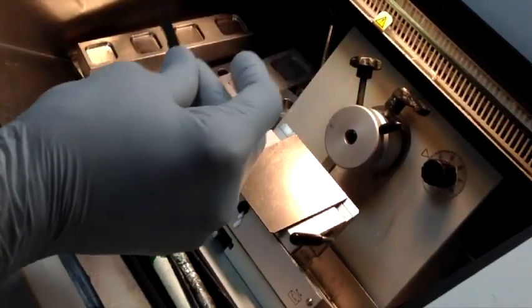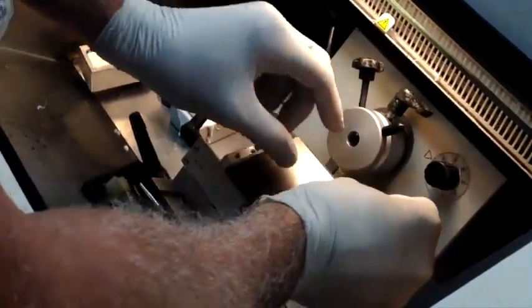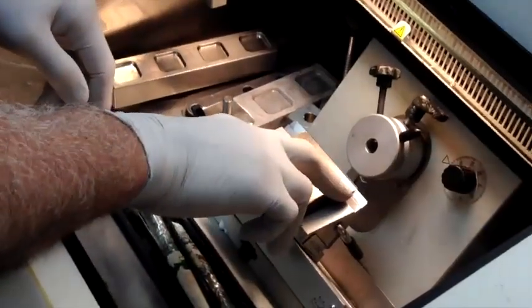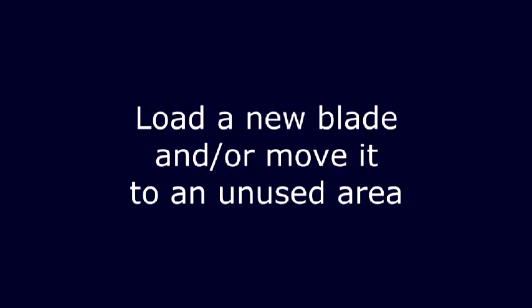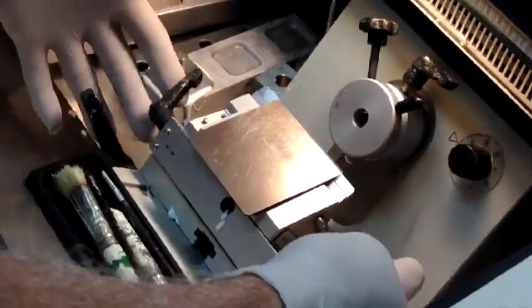I'm going to put a blade in. In the meantime this is continuing to freeze. I'm going to tighten this up and move the blade so that we start on the end right here. As we continue to cut, we'll slide this down as this portion of the blade becomes dull. I'm going to tighten it down — these levers are all tight.